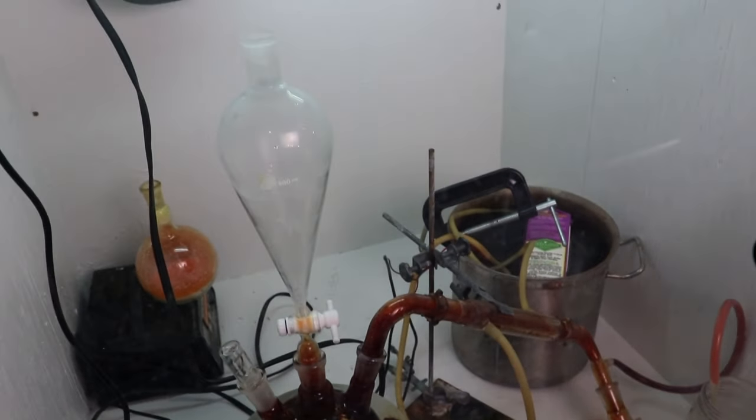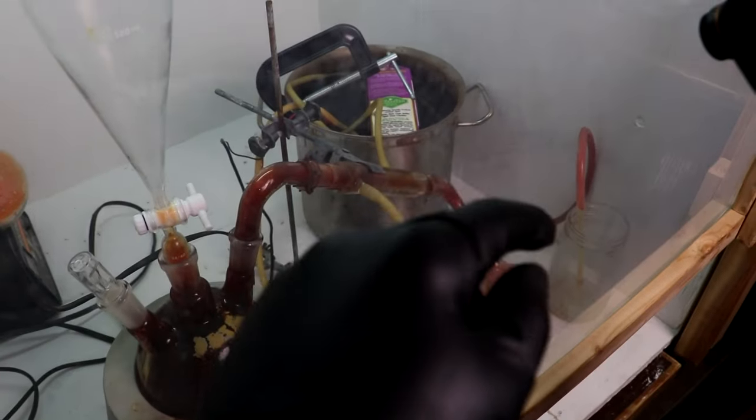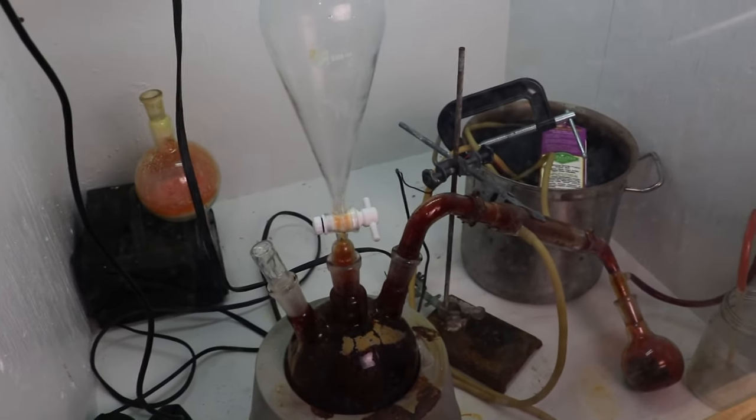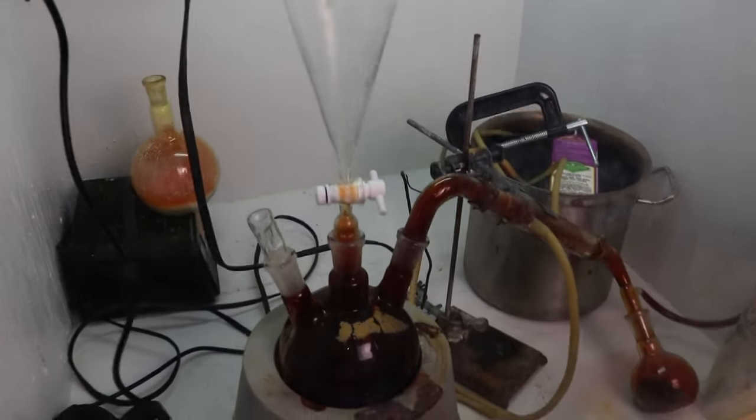See, that's what this thing is for, those occasional accidents. I want to try to avoid releasing gases as much as possible, but you know, occasionally when something like that happens, it's nice to not have it go out into the room.